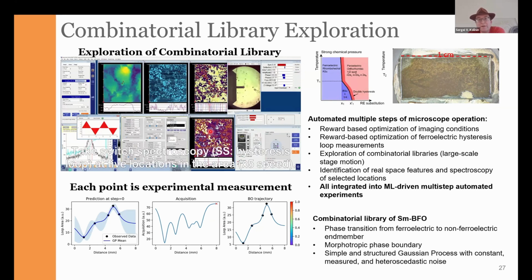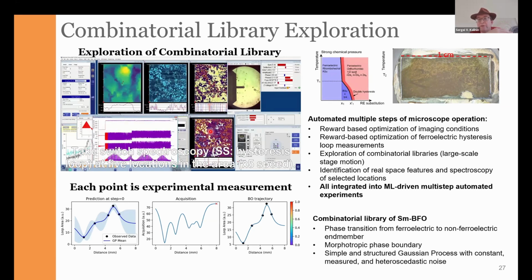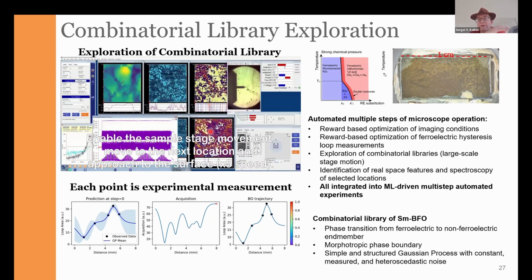So it turned out that if we want to run this experiment, it turns out to be much more complex than just moving around on the sample surface. So the topographic imaging in AFM is relatively robust. Functional property measurement requires tuning the instrument several times, and it requires some form of checks and balances to avoid landing the probe on the dust particles, and so on and so forth.